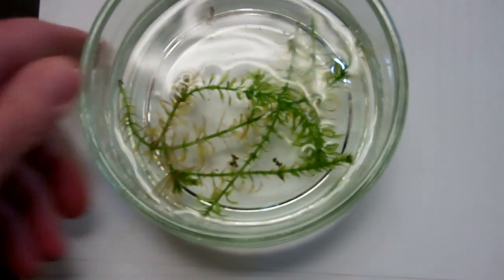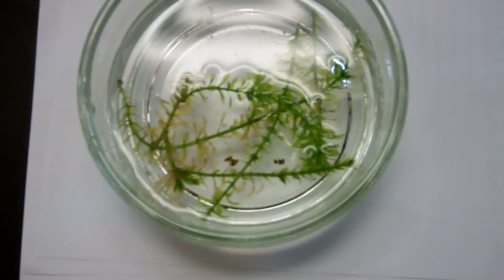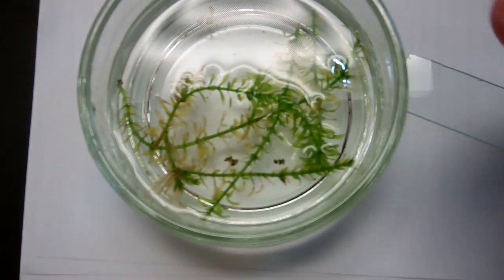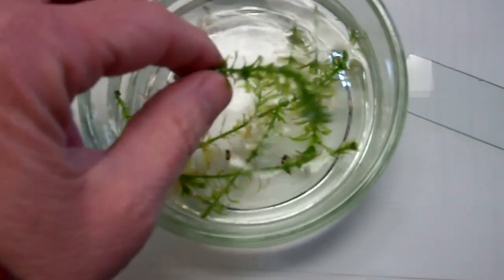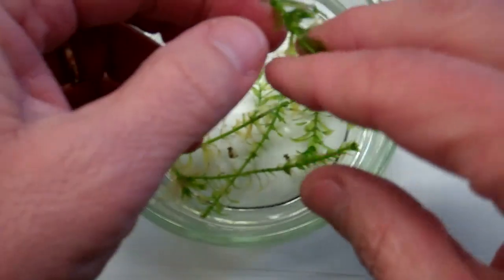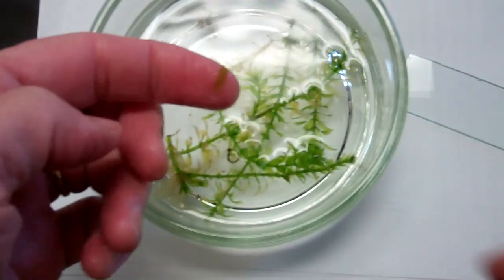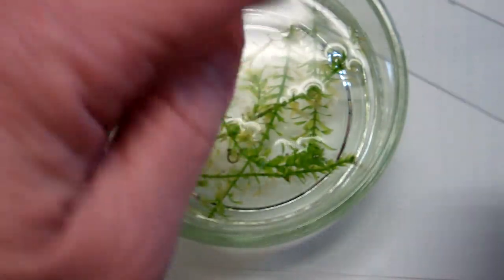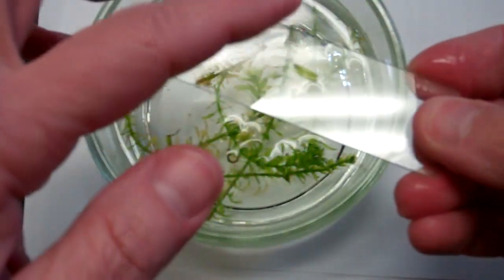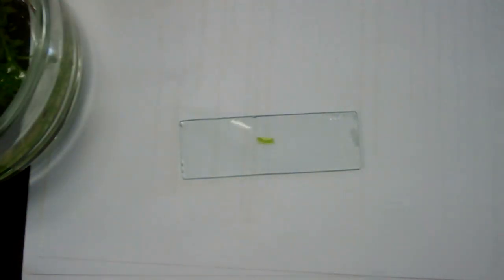So we're going to start with some Elodea, a little water plant, a freshwater plant, and your lab tells you to pluck off a leaf, one little tiny leaf from here, and I'm going to take one little leaflet, put it on my slide, and then I'm going to add a drop of water, tap water.